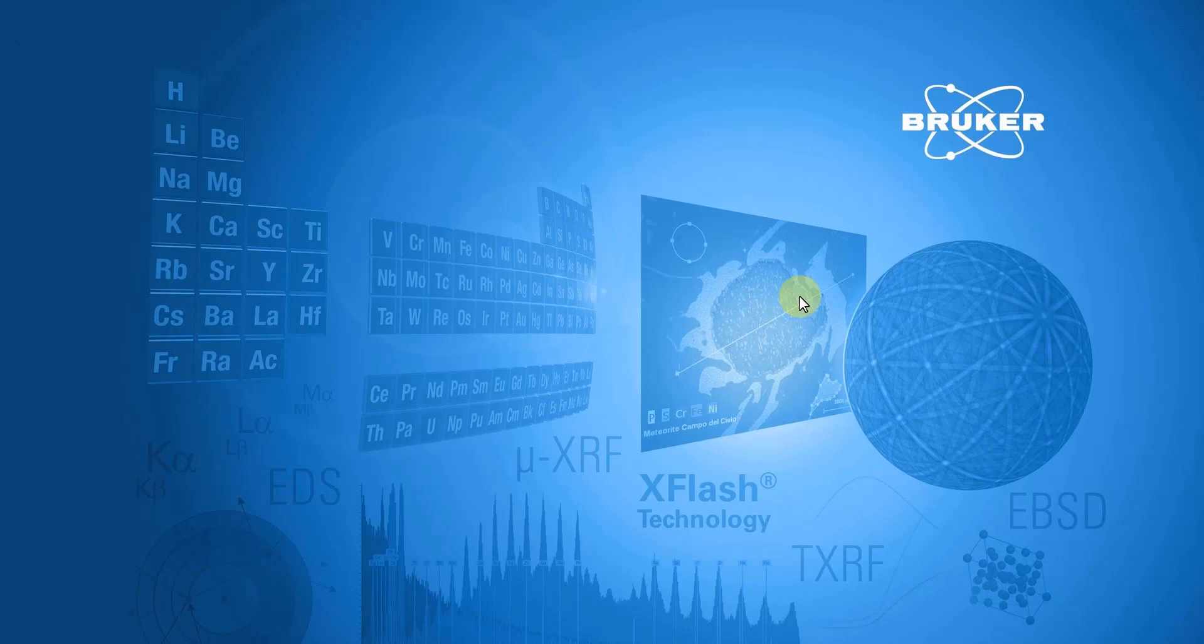Hello, and welcome to the support tutorial video for Brooker Handheld Products. This video will review the library matching feature in Artex software, which allows the user to build a library of known reference materials and find the best match for unknown samples.